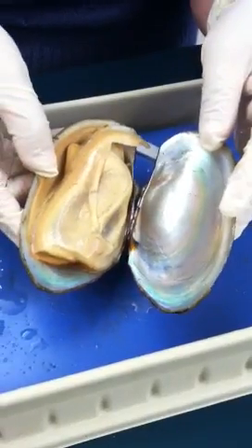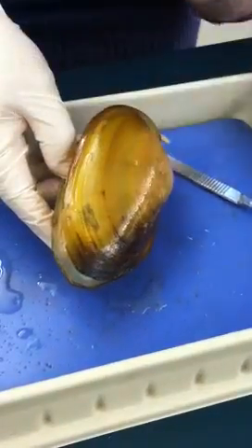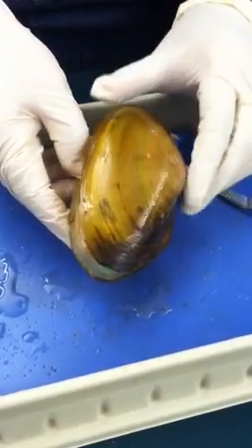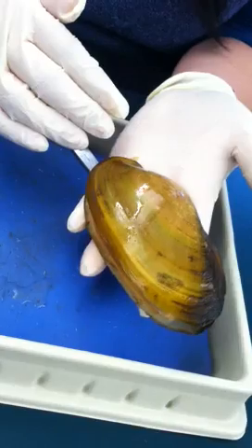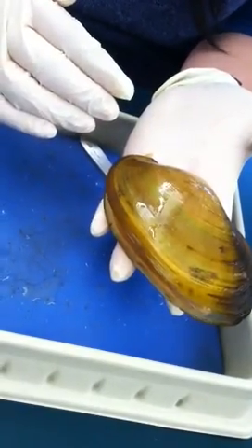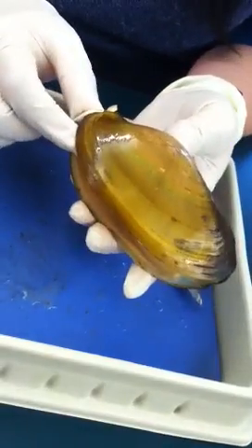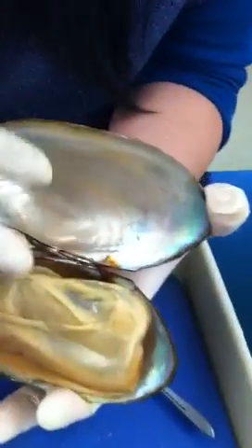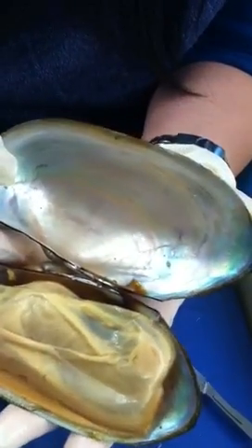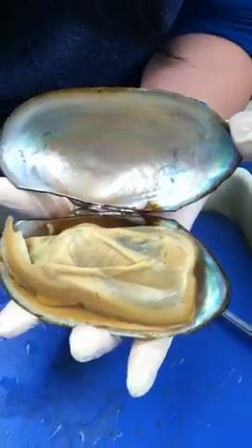After you have everything opened up, we need to identify the shells. The shells have three layers. The outermost layer is what we call the periostracum layer — it's made of protein. If you flip the shell, you will see a very shiny structure called the nacreous layer. It's shiny because it's made of calcium carbonates.